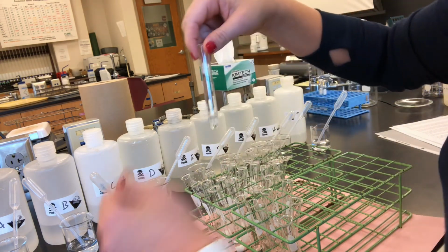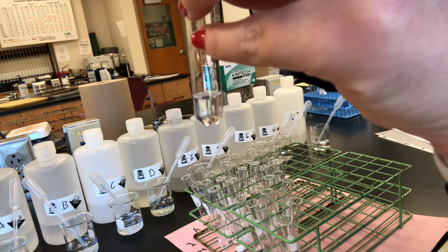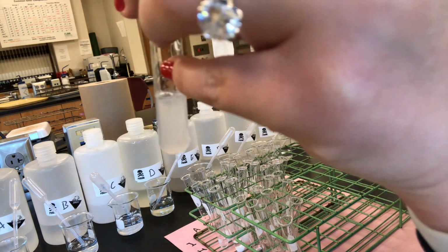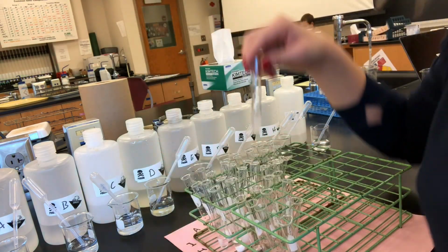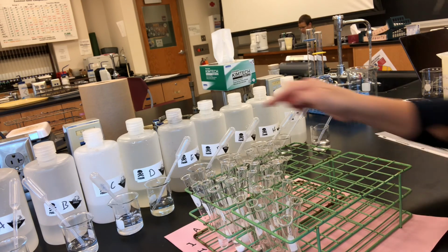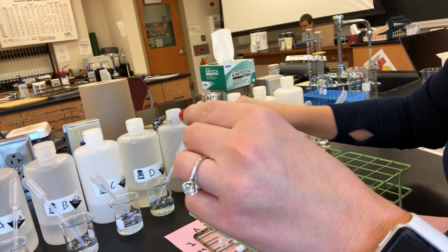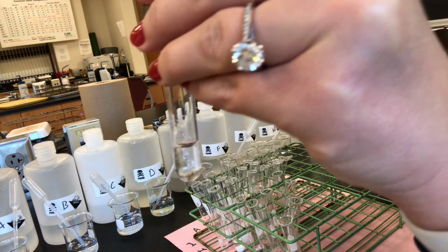All right, next up C and F. Ooh, we got one. C and F. We got ourselves a precipitate. C and F. All right, so now we're on C and E. C and E, no change.